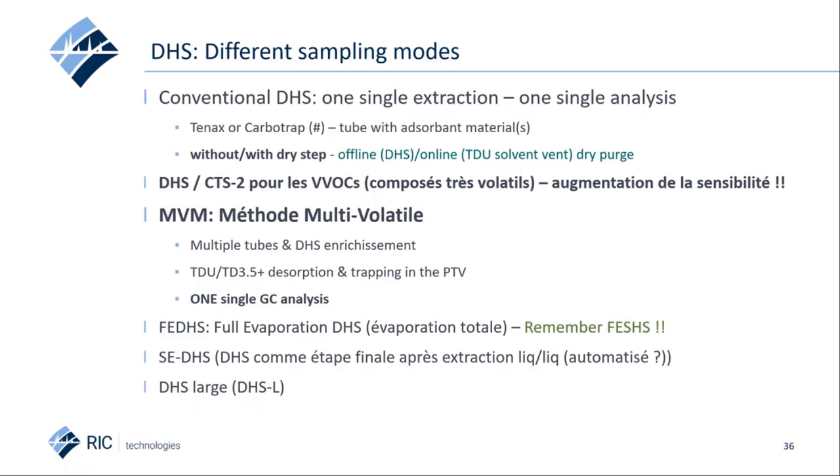DHS can be used in different modes. Where the topic of today, and the time doesn't allow us to go too much in detail in the huge flexibility of the technique, I only highlight what we discussed already and also the possibility to use DHS in the multivolatile mode, MVM, which gives us the opportunity to combine multiple DHS enrichment steps in one single analysis of one single sample.